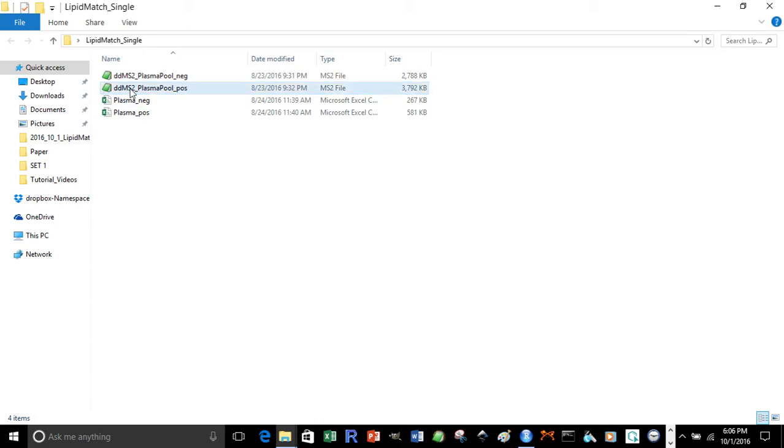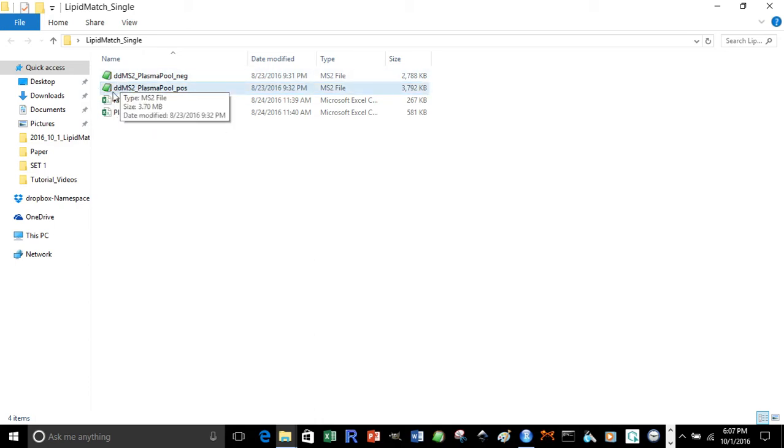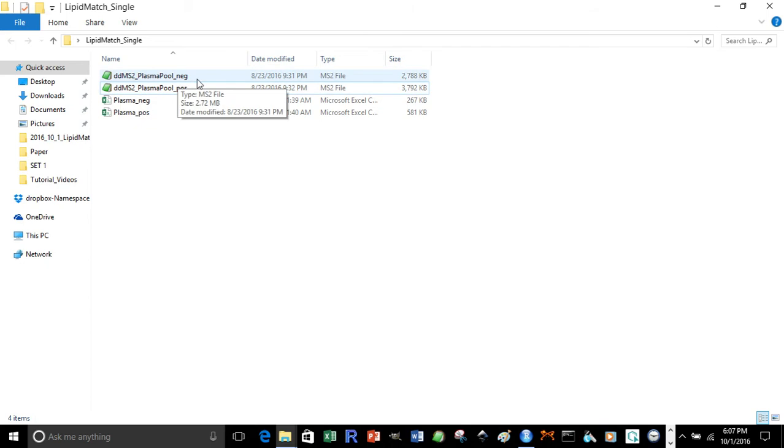Note also that the data-dependent files should have DD in the name somewhere and should end in neg or pos depending on their polarity. Feature tables should also end in neg or pos depending on the polarity they represent.